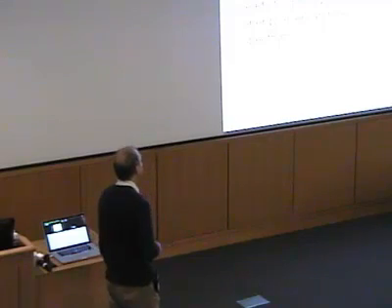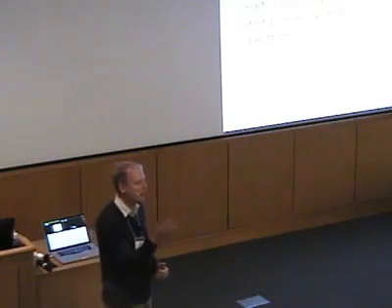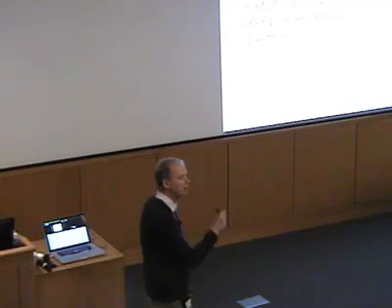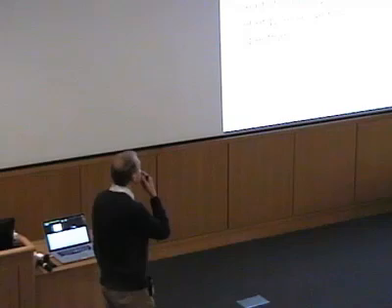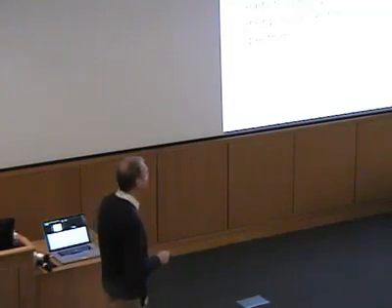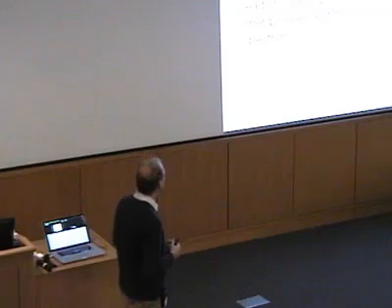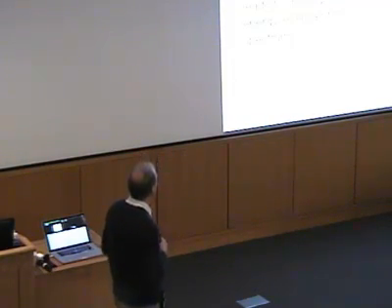Okay, so if that was the whole of the experiment, it probably wouldn't be all that interesting. If all we could measure was just the position where this transition occurs, we might learn a little bit about the spin-orbit coupling in our sample or be able to use it to detect the presence of some paramagnetic species. But the thing that really makes EPR useful is the additional interactions which the spins can undergo. So this is interactions between different types of magnetic particles and the spin-orbit coupling, which we'll talk about in a bit.